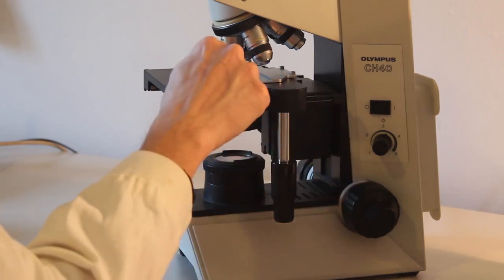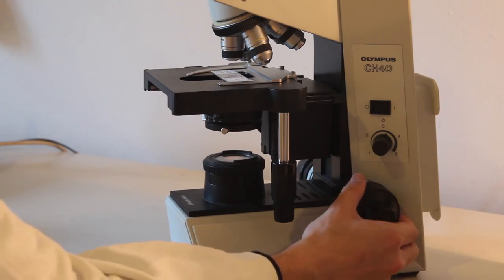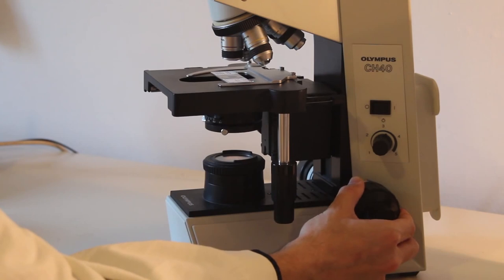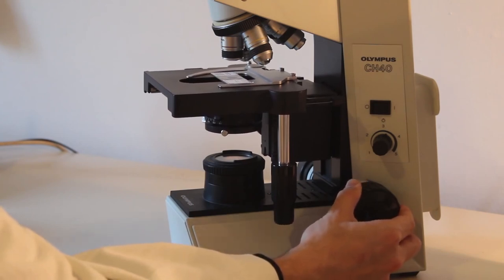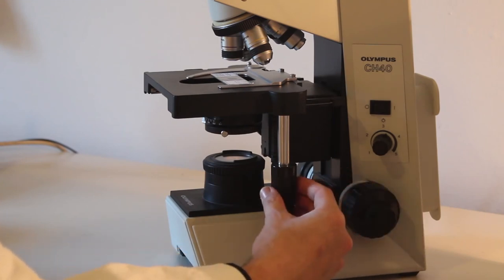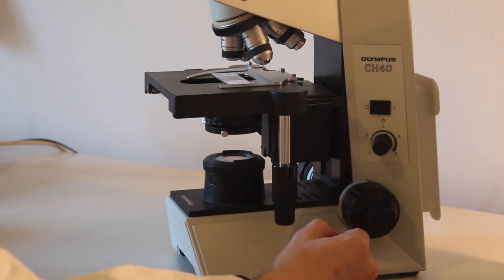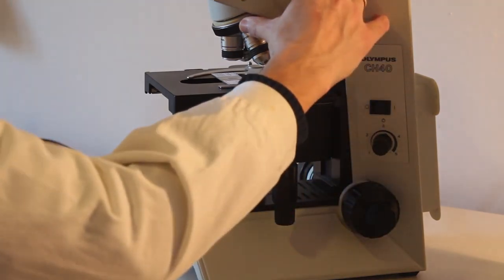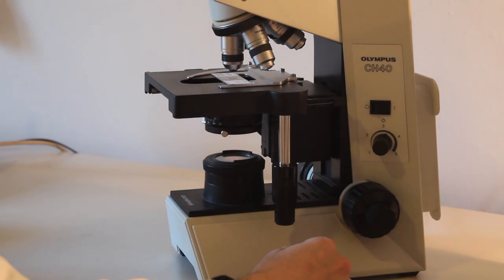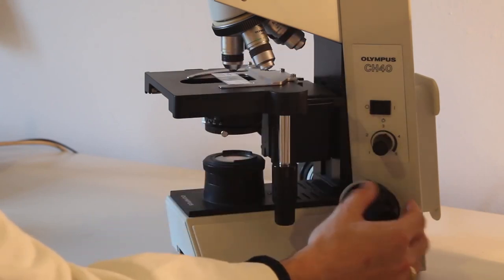With the low power objective in place and the stage raised all the way to the top, look through the microscope and lower the stage until the specimen is in focus. Once in focus, re-center the specimen using the mechanical stage, and then switch to the next higher power. From now on, only use the fine focus knob — the small one — otherwise there is the danger of crashing the slide into the objective if you use the big coarse focus knob.